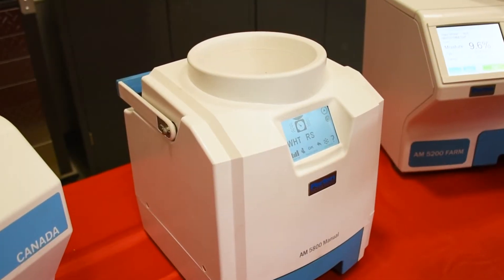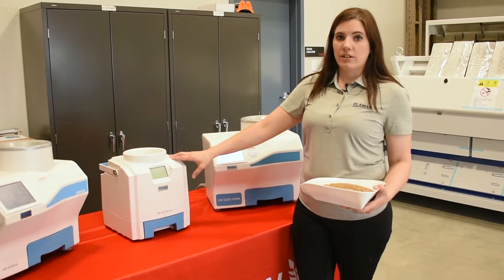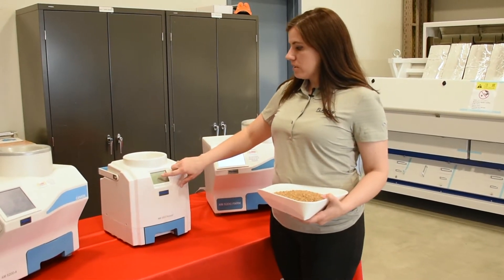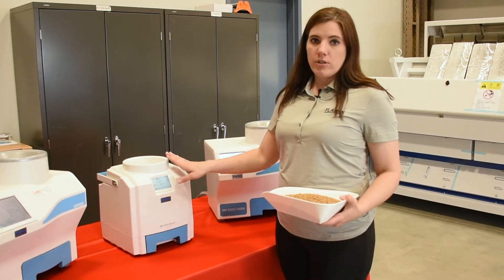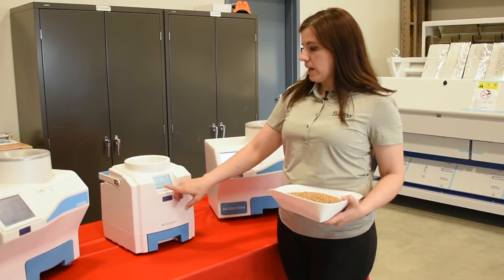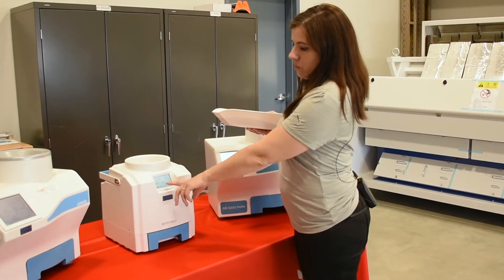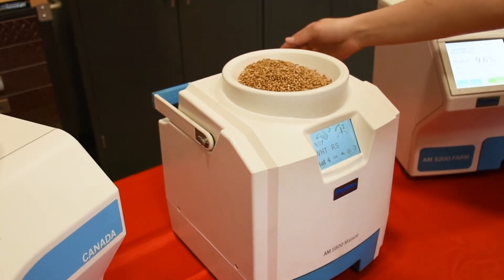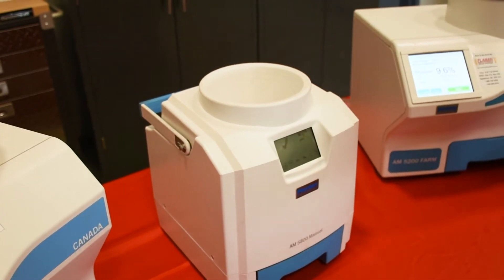The 5800 is the portable moisture meter from Perton. It runs on two AA batteries and uses UGMA technology to determine the moisture in the grain. You just touch the touchscreen to turn it on. There are 32 pre-programmed grains, and you select the grain you're going to use — Red Spring today. The touchscreen walks you through what you need to do, so we pour the sample in the top. There's no need to measure it out; you just pour it in and follow the instructions on the touchscreen.